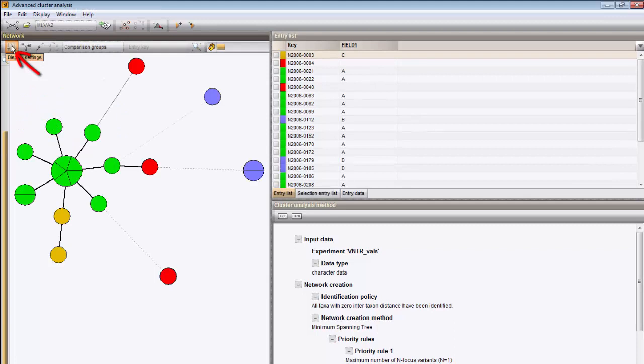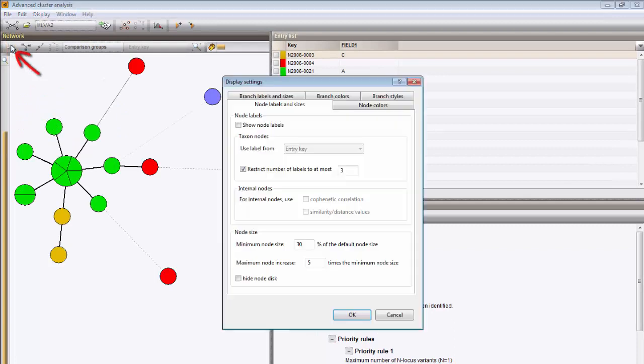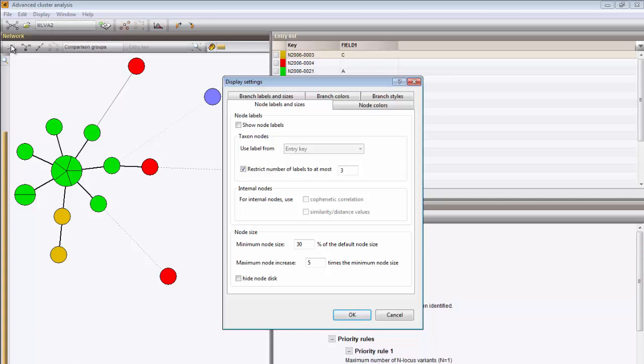Under the button Display settings, you can find a number of options to adjust the looks of the tree. I can, for instance, show the keys next to the nodes.